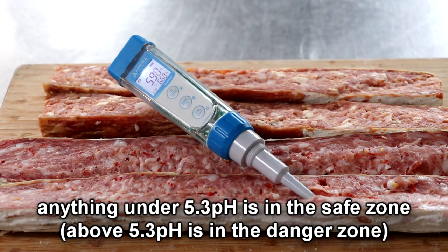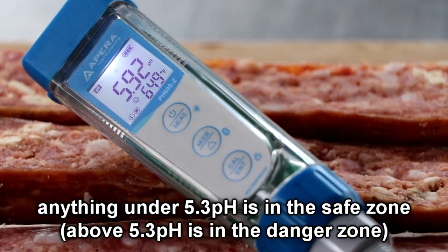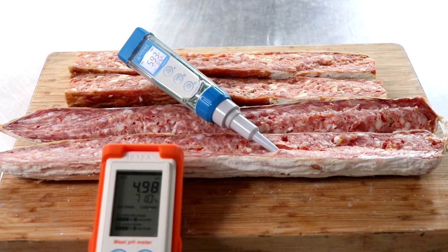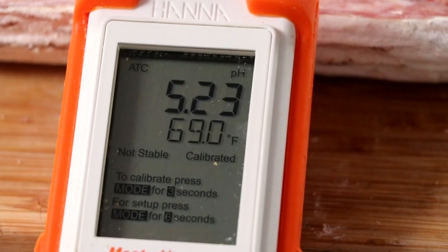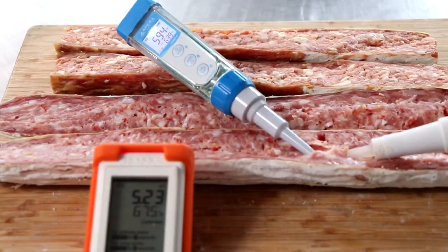It was obviously pulled too early and hitting your pH safety hurdle is absolutely critical when making fermented sausages. Now is this going to kill you? Probably not — we had enough salt and enough cure number two — but the truth is I don't know. It may make you sick, it may do nothing. The texture is certainly unappetizing so I'm not going to eat it. Let's go ahead and test this world's hottest salami — it's testing out at 5.25 on the Hanna, where the Apera Instruments is 5.93. I'm going to trust the Apera Instruments because I know the slope on it. The Hanna pH meter is about a year and a half old, and at that point it is about time to change it, but you would never know unless you had a way to test the slope.